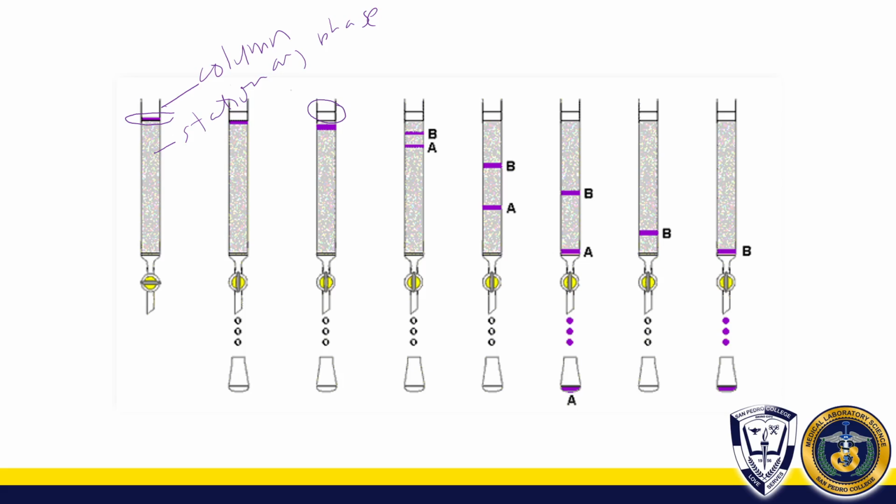So, let us take for example, your analyte is your blood. And di ba, blood has a lot of components inside. So in order to get one substance from the other, mao na nang separation na buhaton natin. And unsaon siya pag-separate? So imagine, daghan pwede factors na isipon ani. It could be the size, di ba? Dako si glucose, gamay ang uban ninyo na mga substances inside the body, or it can be in terms of electric charges, di ba? Proteins carry positive and negative charges. So mga ingana ang atong buhaton diri sa inyong chromatography.